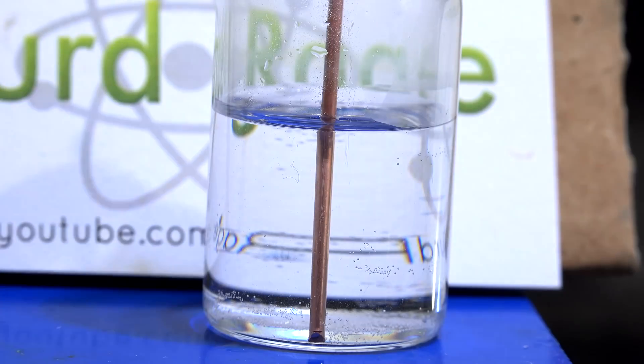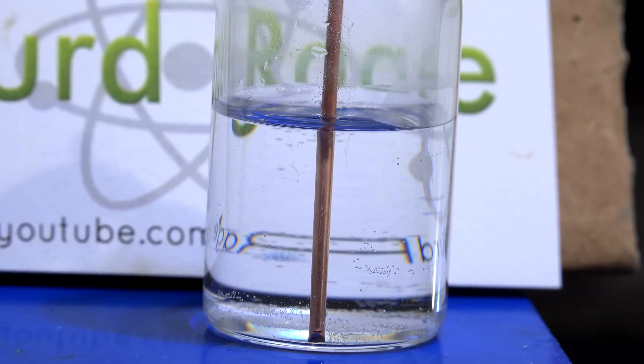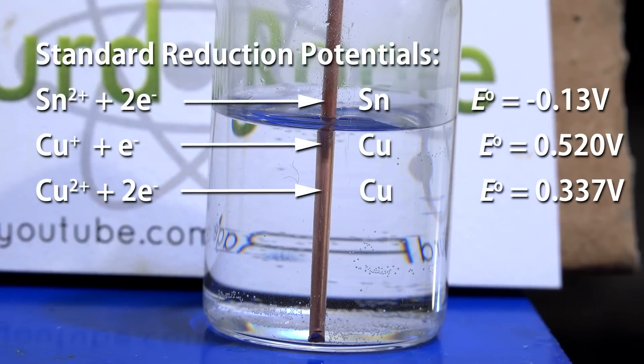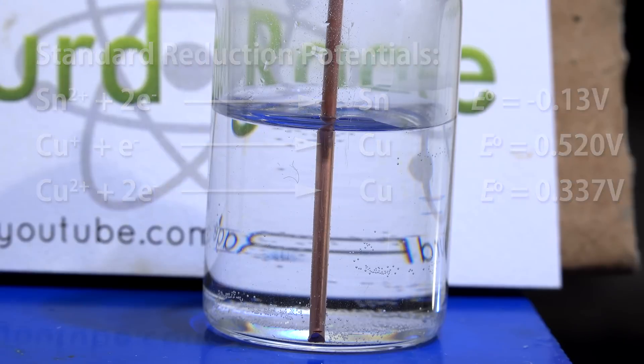Now if you put in copper metal nothing will happen. This makes sense since the reduction potential for copper is higher than that of tin. We'll never be able to displace copper with tin, but there is a trick we can do.